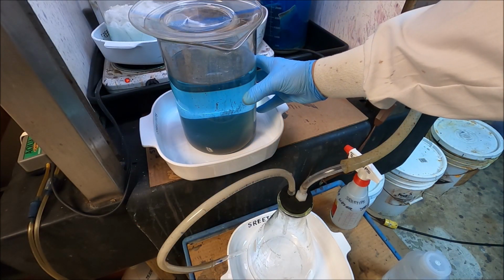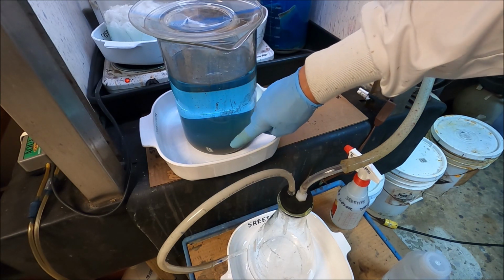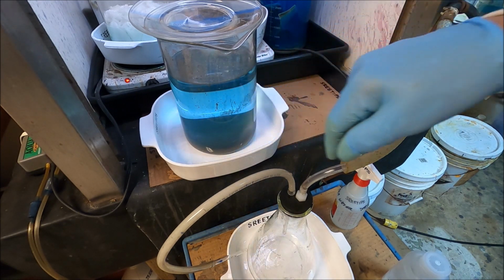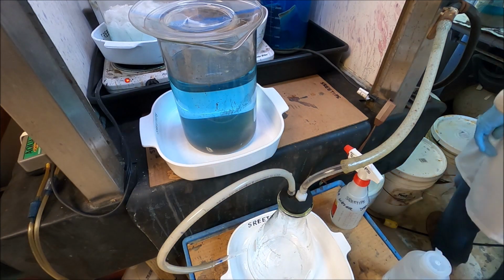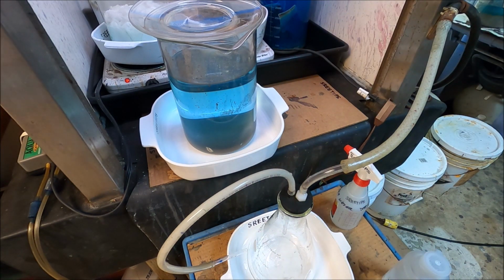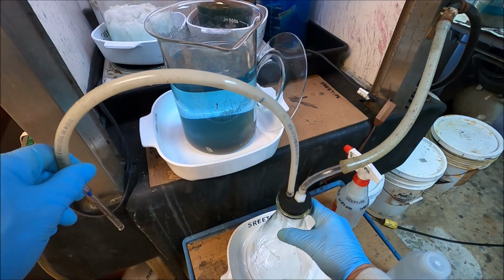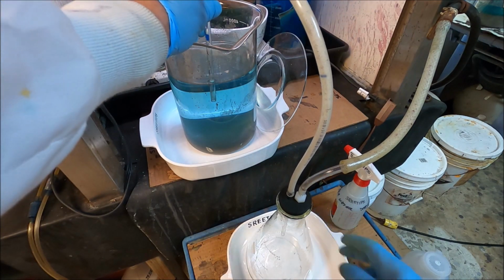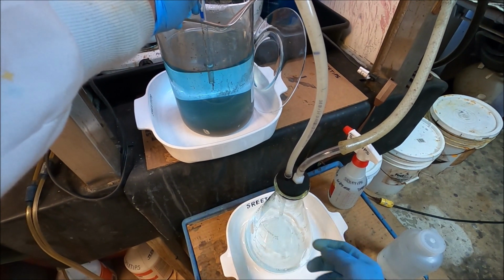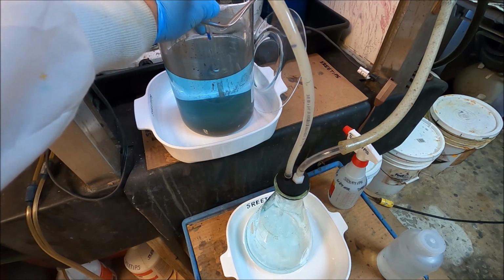Beaker that has the strained out solids down in the bottom of it. It's all settled out. It's got some nice solution above it. This is going to be full of silver. So what I'm going to do is turn my vacuum pump on. And now we're going to draw out the solution out of this beaker right here. Collect it into this flask so that we can filter it out, and then we'll put this in some copper and cement the silver out of this solution.